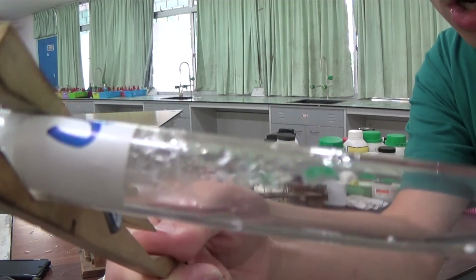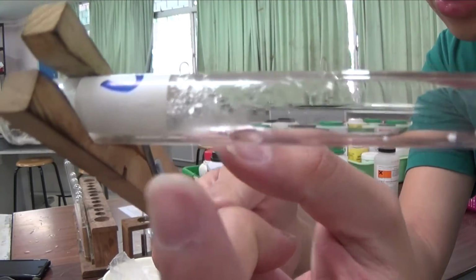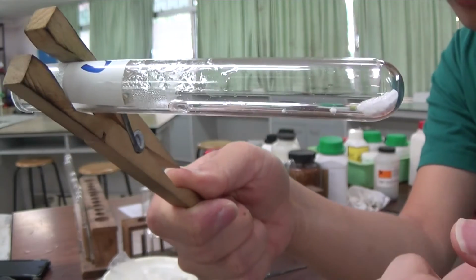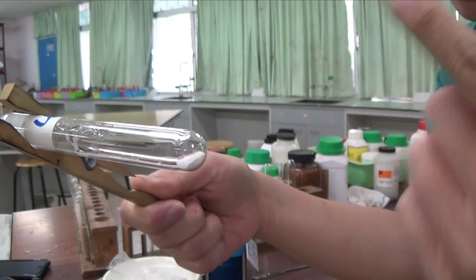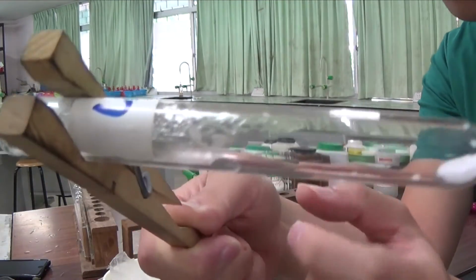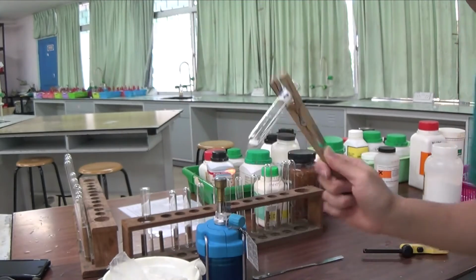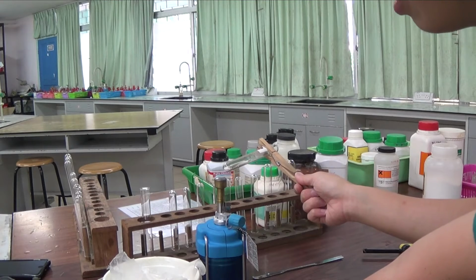As you can see, there is condensation on the upper part of the tube. It is a colorless liquid, so you don't see water, by the way. You see colorless liquid form on the upper part of the tube. It is actually pretty hot, so you don't want to be touching this end. You do not put it into water straight away, because a hot test tube, hot boiling tube, straight into water, not good at all. They will break. Okay, so colorless liquid forms on the upper part of the tube. You can be sure that this thing is hydrated. Well, it was hydrated. You can, of course, heat it until constant mass.